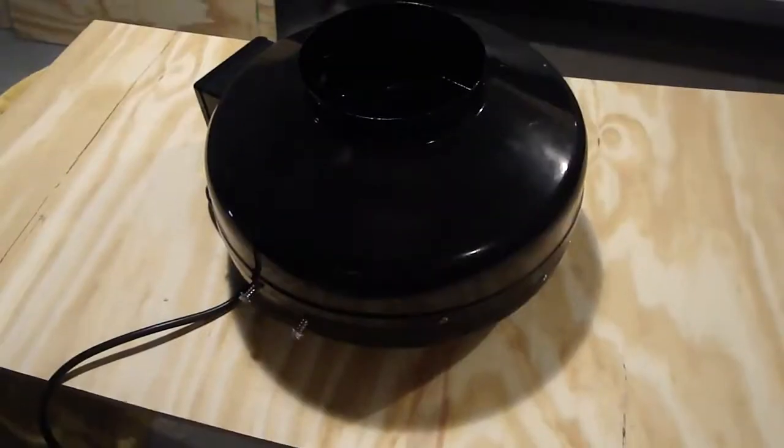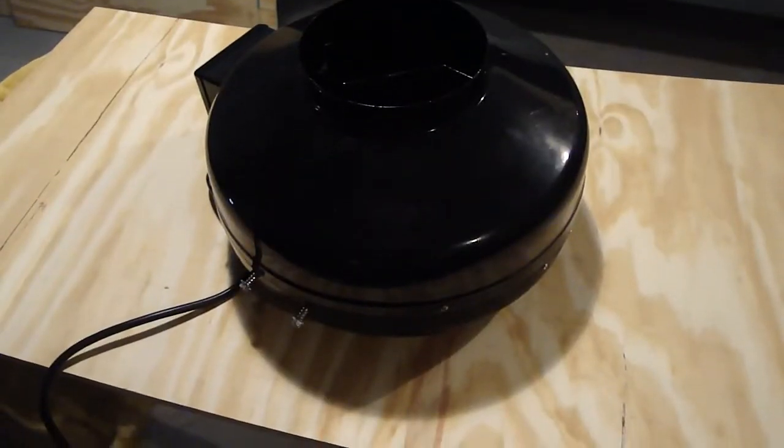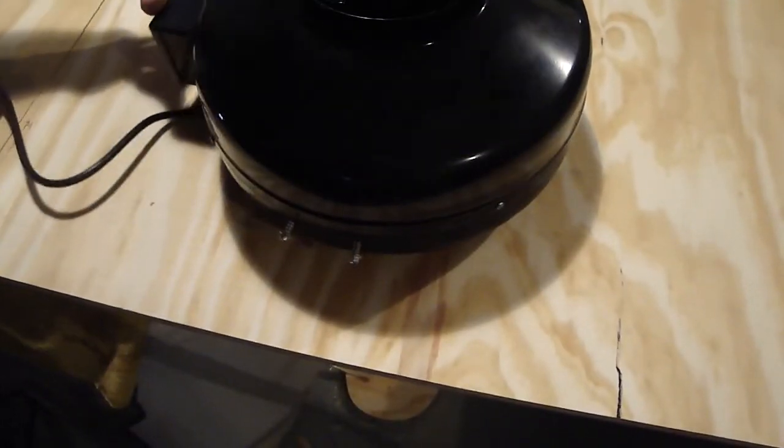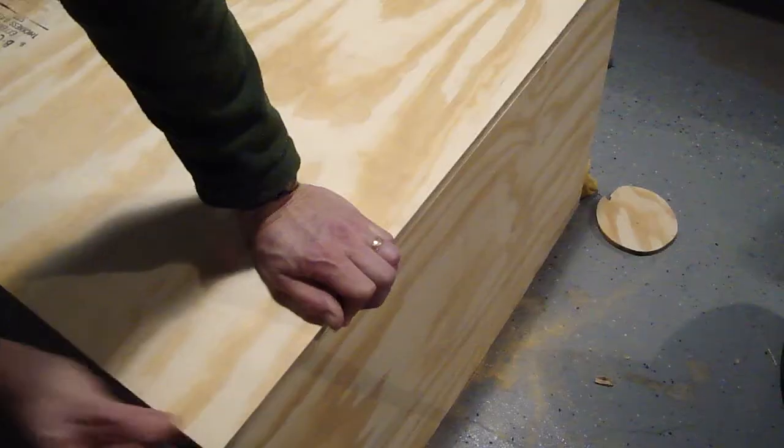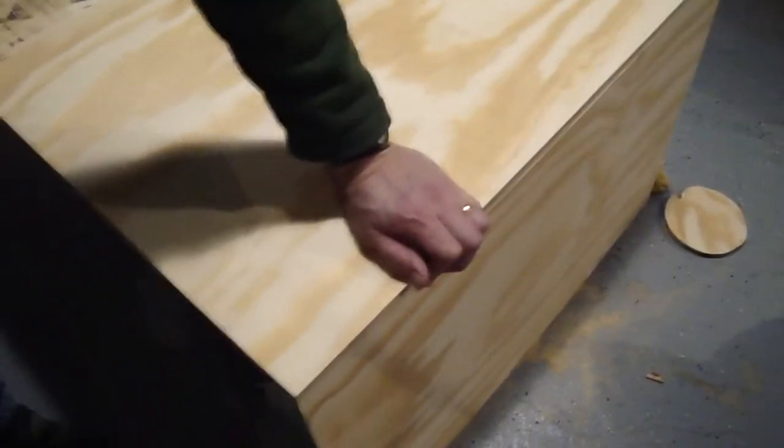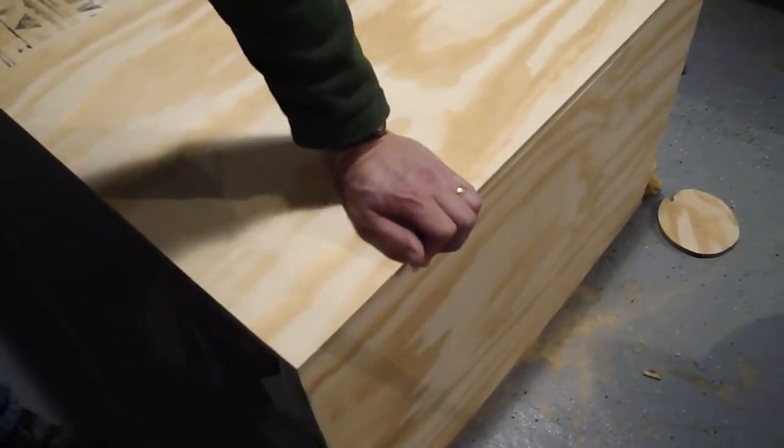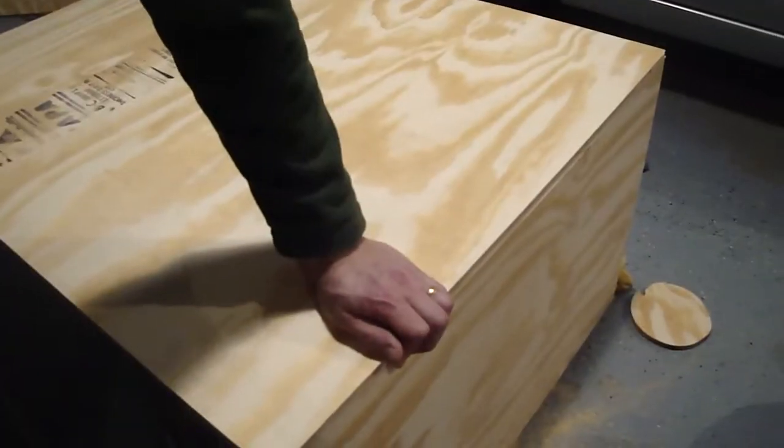Well, we've got it so that it's fitting now. We can probably start to assemble the box. So now we're ready to start drilling holes and putting in the screws.